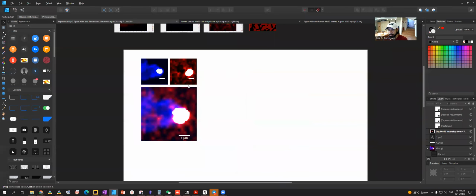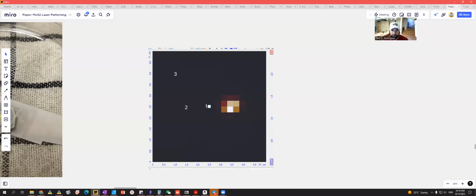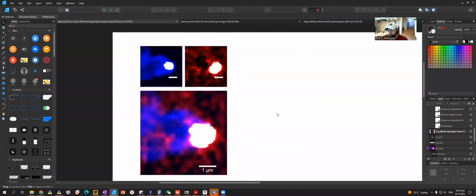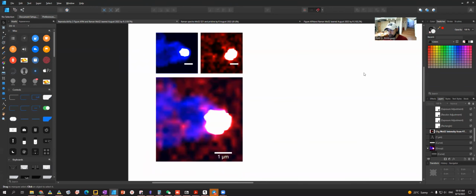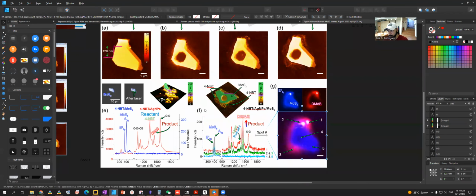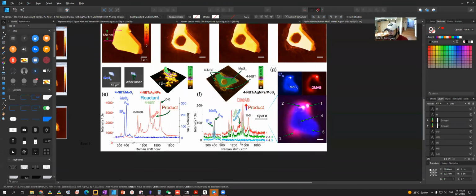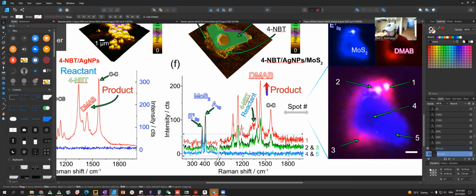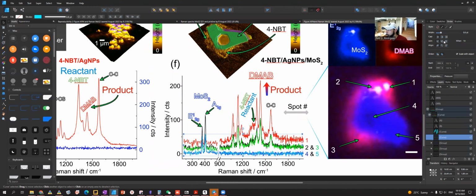The second part is to add the spectrum, from this hyperspectral map. Then you take the curves and put them also here in Affinity Designer. You can play with them and get to this, like I did here. You can go to Origin, or you can use whatever software you use for processing the curves. Copy paste, and then you can also have these editable files where you can change the curves individually, like the thickness, the color, and so on. That's the next step.